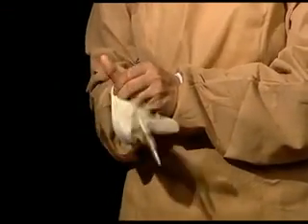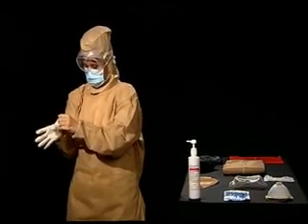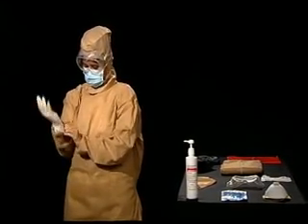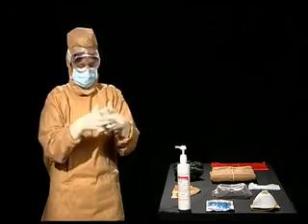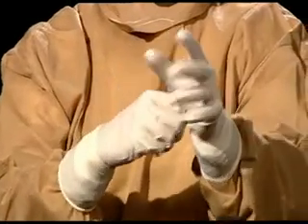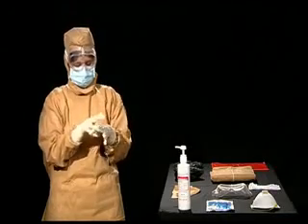Hold the glove at the upturned part and roll it over the palm as you go along. Pull the glove all the way over the cuff of the gown, and then holding the edge of the folded part, roll the glove down. This way your body will not come in contact with the sterile part of the glove. Repeat the same exercise with the other hand. Once both the gloves are on, stretch and lock your fingers to ensure proper fitting of the gloves.